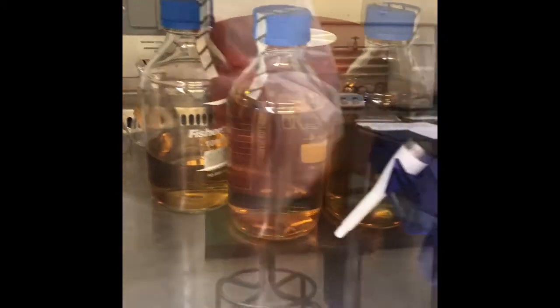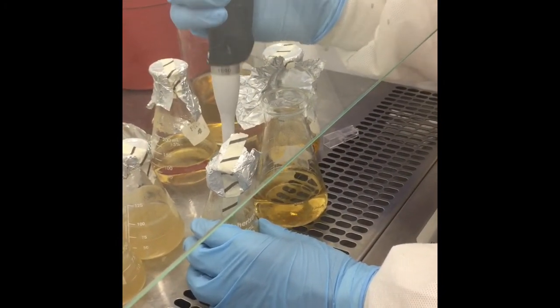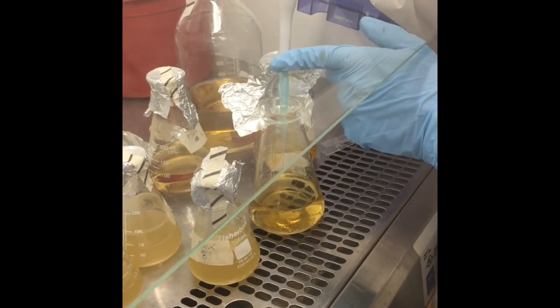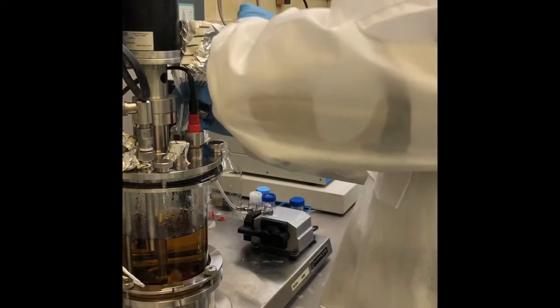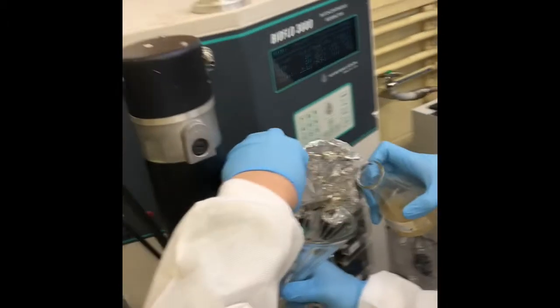We now begin E. coli growth in the benchtop shaker. We filled each of the 3 250 milliliter flasks with 100 milliliters of fresh media. We then pipetted 2.5 mLs of our inoculated bacteria into each flask. The flasks were then placed on the shaker to begin cell growth. We now began E. coli growth in the bioreactor. Once the media in the reactor is at temperature, we poured 50 milliliters of inoculated bacteria into the reactor.